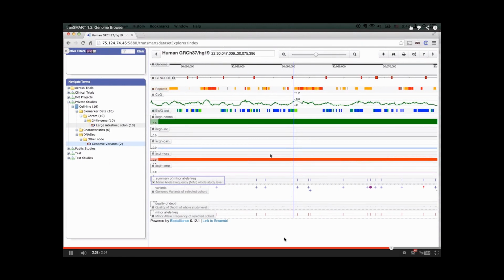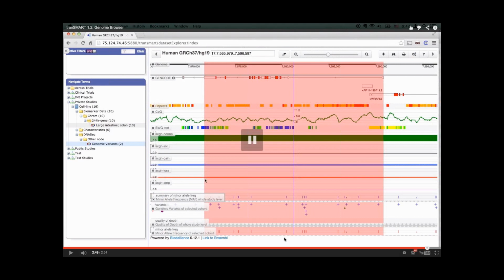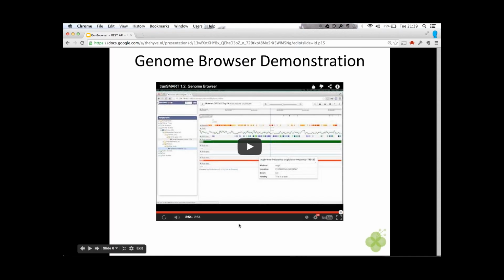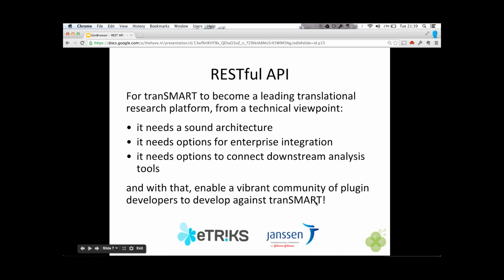Of course, I'm also able to navigate, zooming in and out, and I'm able to go to specific genes as well. The scrolling hopefully now should even work on an iPad. That's one of the things we try to fix. So going to a gene is as simple as just typing in the gene name. If we take, for example, the human tumor suppressor gene, TP53, you can see here the different variations that I have in that particular gene. And here, okay, so here you can see actually there is a minor allele frequency of half, meaning that we have the alternative allele in one of the 2 samples.